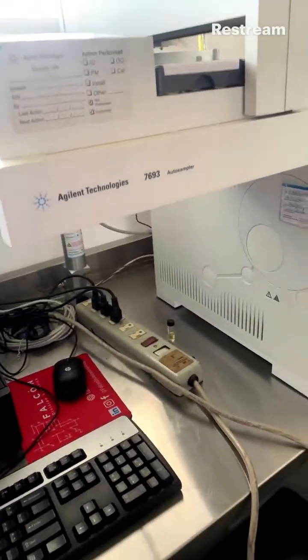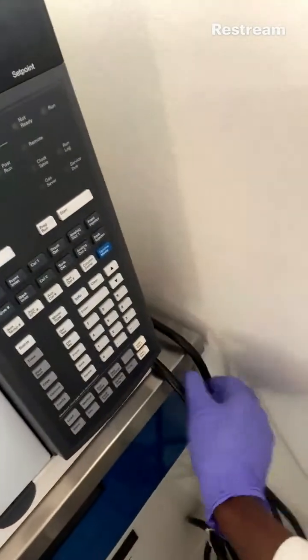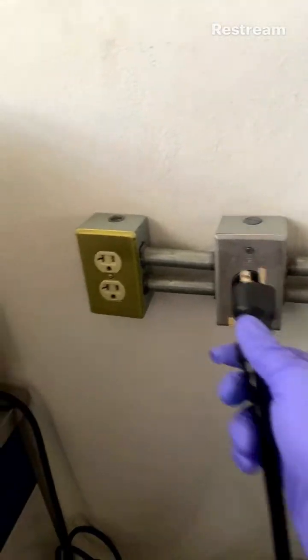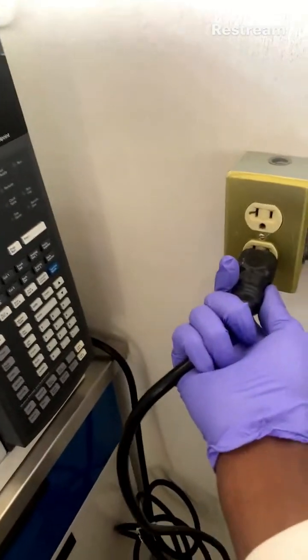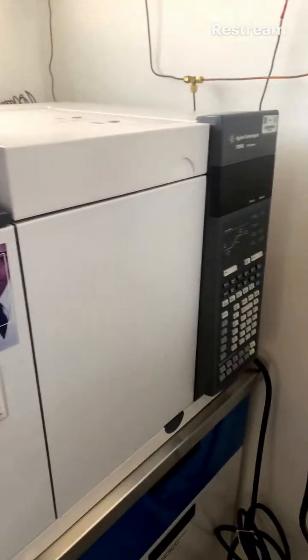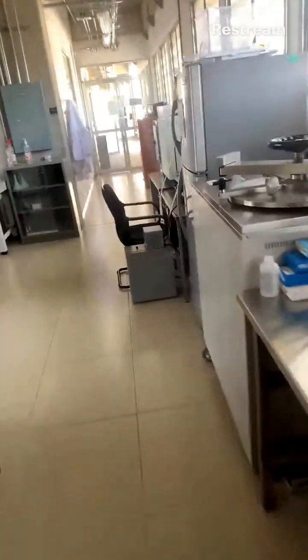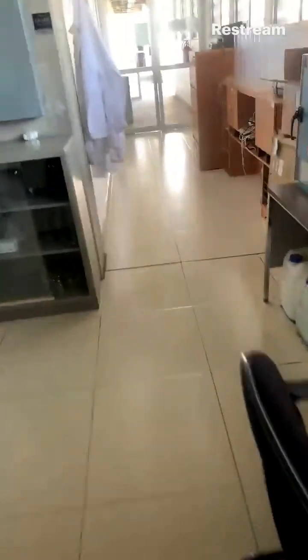So I think every other thing is ready. I need to plug in my machine. Then I will go to open the gases.